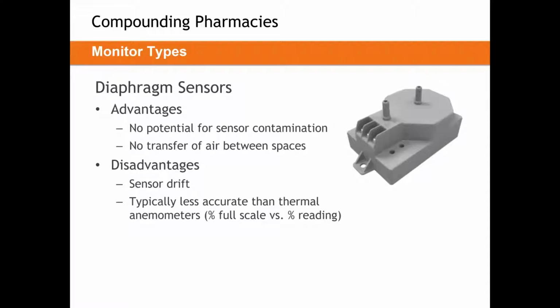I always want to make a distinction between the monitor and the sensor itself. They are two separate parts. A lot of monitors can work with a whole lot of different sensors, and these sensors work in different ways. And basically what I want to dig into here is the maintenance cycle and the accuracy of these sensors.